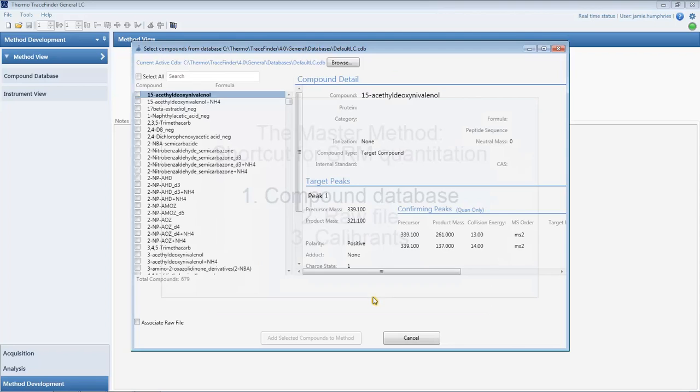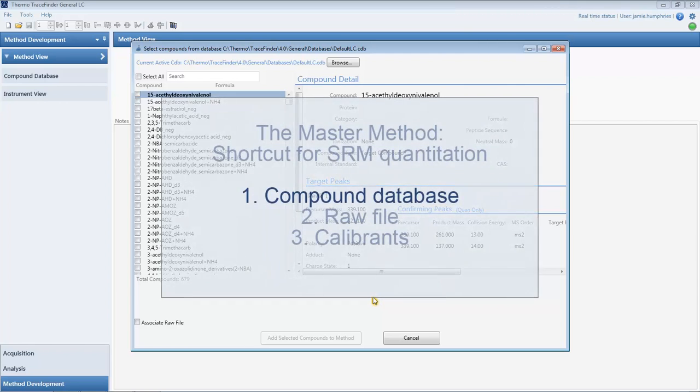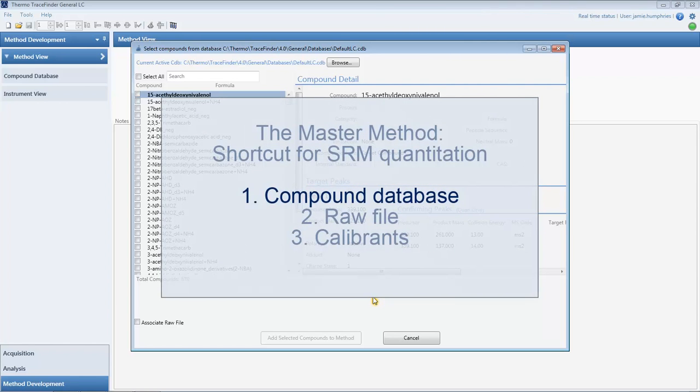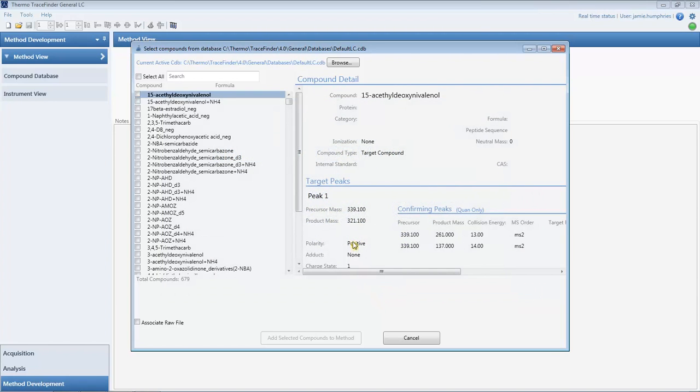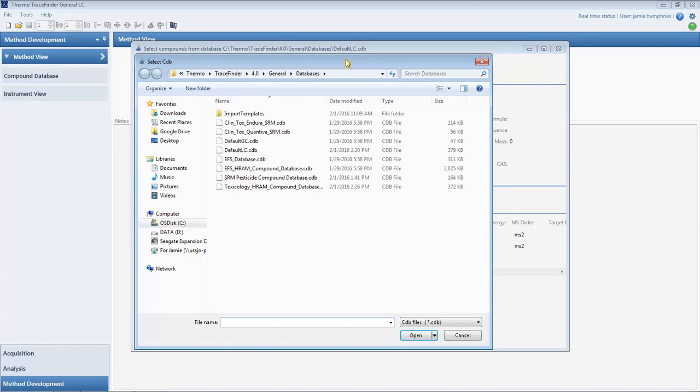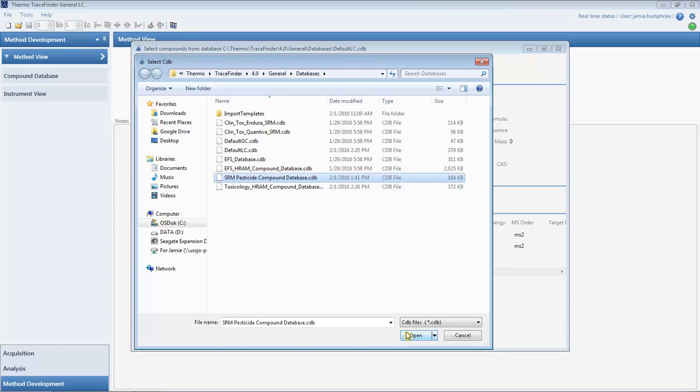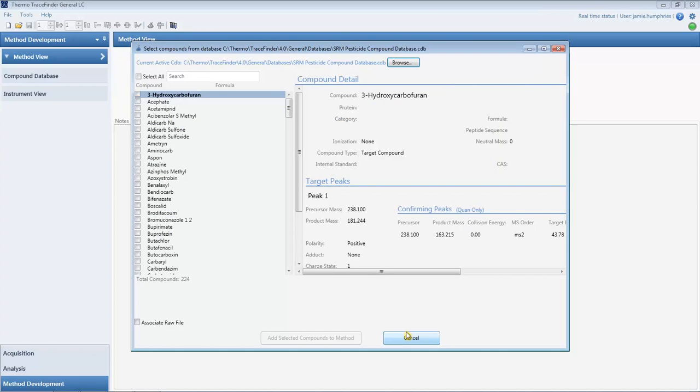First, import the compound database. It can be a stock database or one we created from our compounds of interest. From these compounds, we select as few or as many as we want, which will add the corresponding transitions into our method.